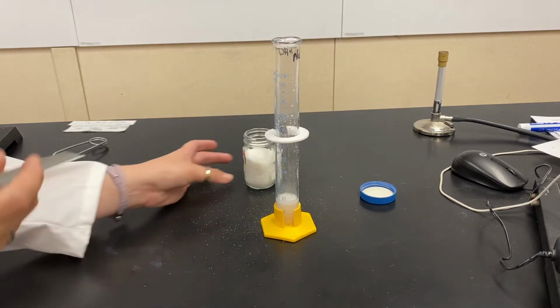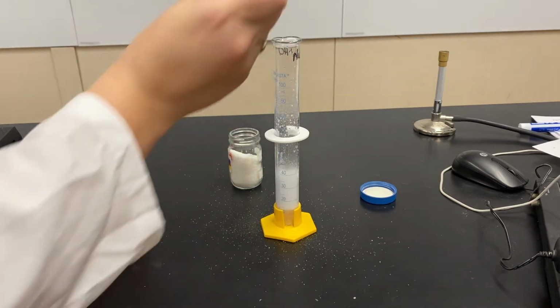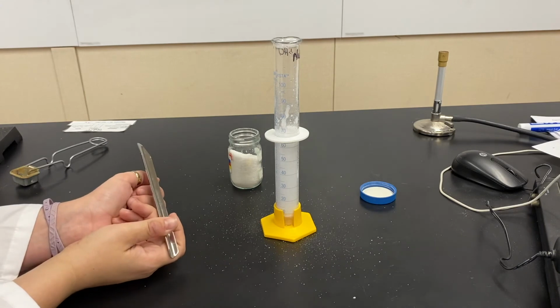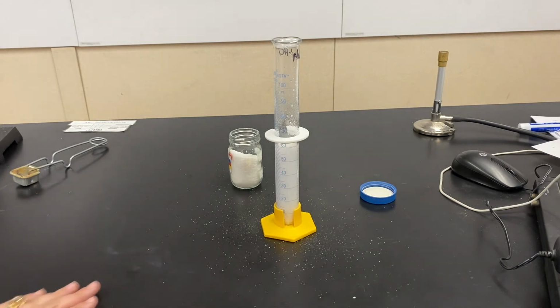You can even try and get really crazy with it. Big ol' scoop. Exciting. Okay. It's just like elementary school trying to make your volcano explode. Yay, science.